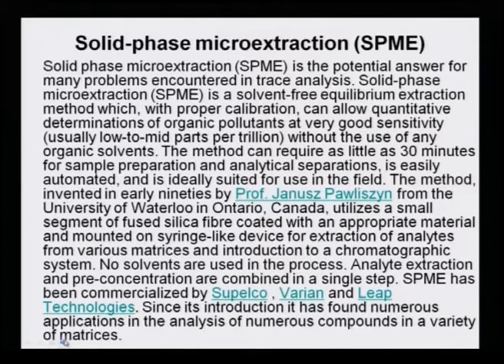Analyte extraction and pre-concentration are combined in a single step, and SPME has been commercialized by Supelco, Varian, Leap Technologies, and these are some of the companies' names who are commercializing such micro extractants. Since its introduction, it has found numerous applications in analysis of numerous compounds in a variety of matrices.